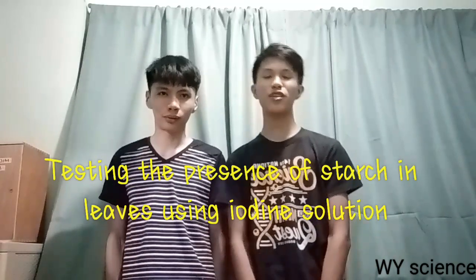Hello guys! Welcome back to WY Science and today we're going to do an experiment about testing the presence of starch in leaves using iodine solution. Enjoy!